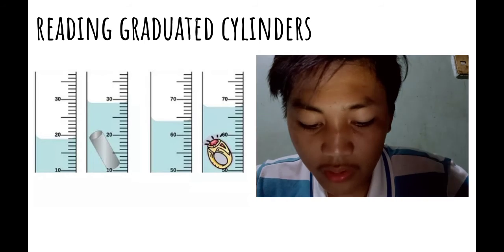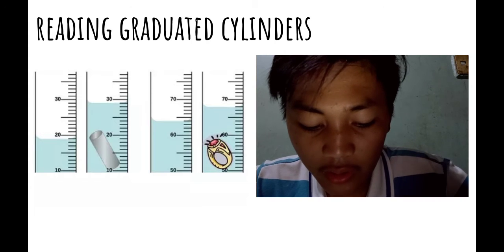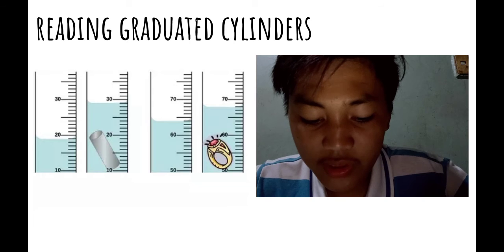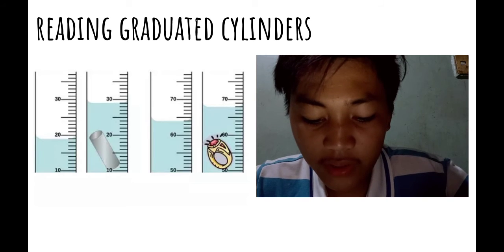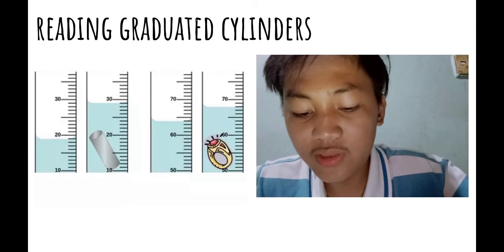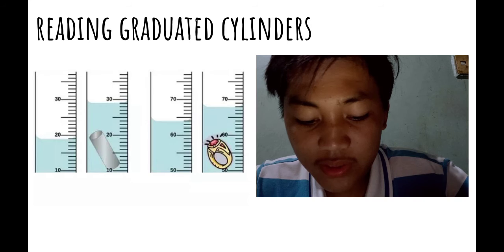There are, counting up from the 60 ml mark, 10 intermediate marks, dividing the interval. 70 minus 60 is equal to 10. Why is the number of increments 10?